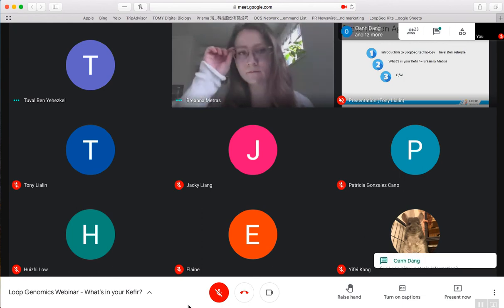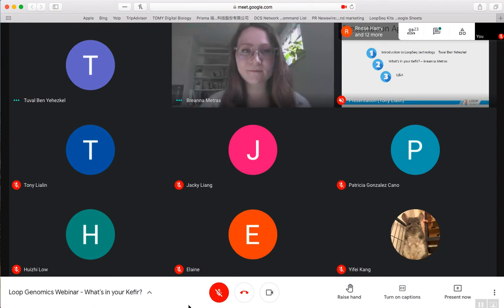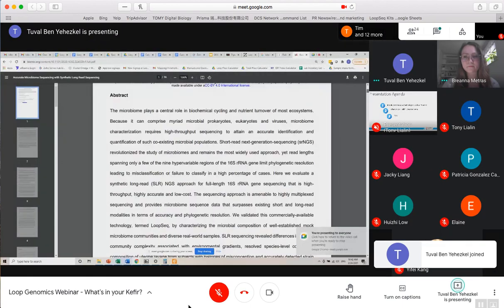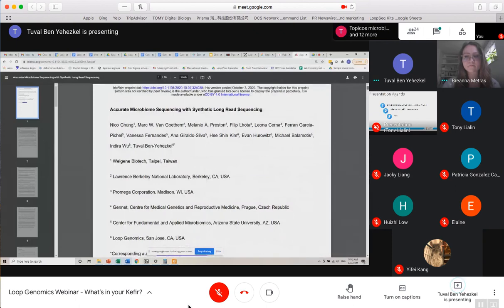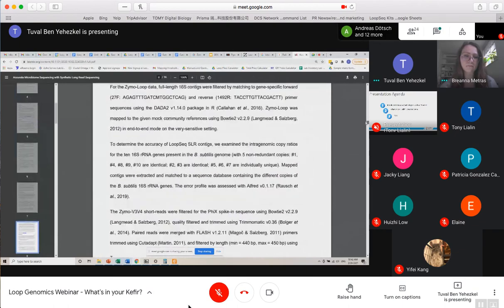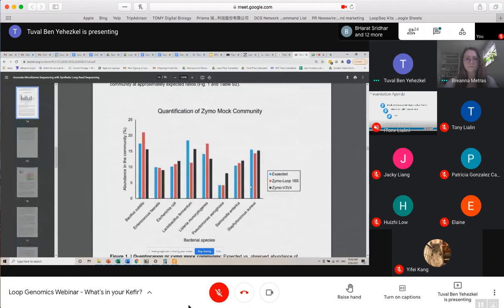Got it. Great. And maybe also to complement your answer, Brian, I can also share my screen again. There was another paper published, again just a few weeks ago, from another group, with multiple groups on this paper. We can send these out. It's titled Accurate Microbiome Sequencing with Synthetic Long-Read Sequencing. Again, it uses 16S on various types of samples. One of the sample types that they used here was a synthetic community made by Zymo Research.